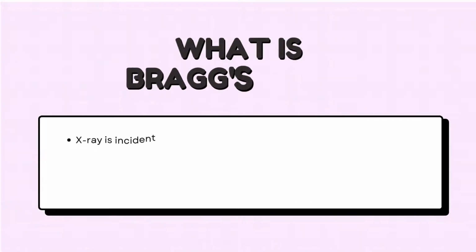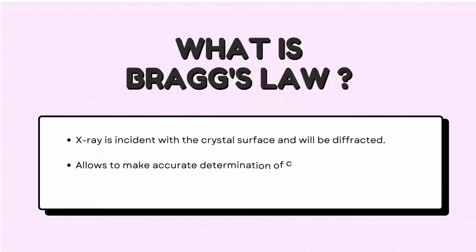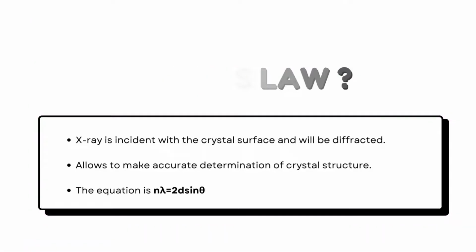X-ray is incident with the crystal surface and will be diffracted. Bragg's law also allows us to make accurate determination of crystal structure. The Bragg's law equation is n lambda equals 2d sin theta.